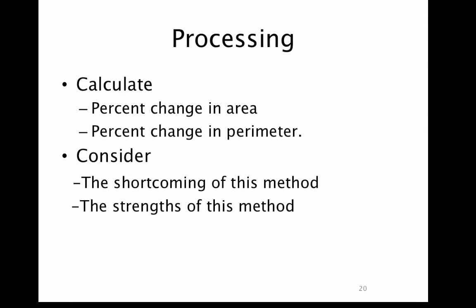Of course, you could process this data in a similar manner to any water potential lab by calculating percent change in area. No method is perfect. What are the shortcomings of this method compared to using something like potato cores? For one thing, we're using area, not volume. So while the trend should hold, the data will be different.